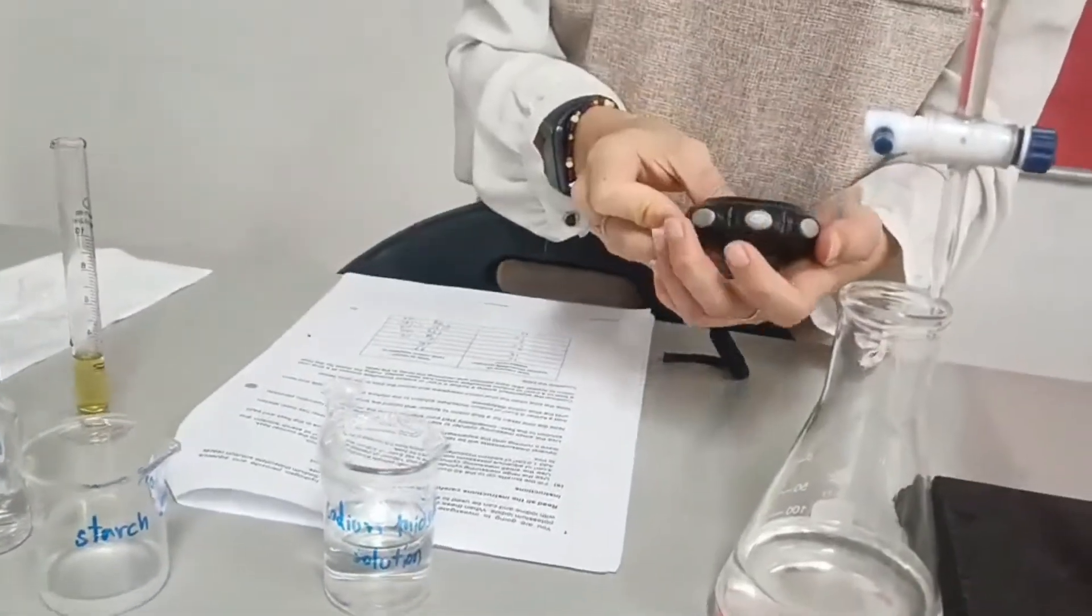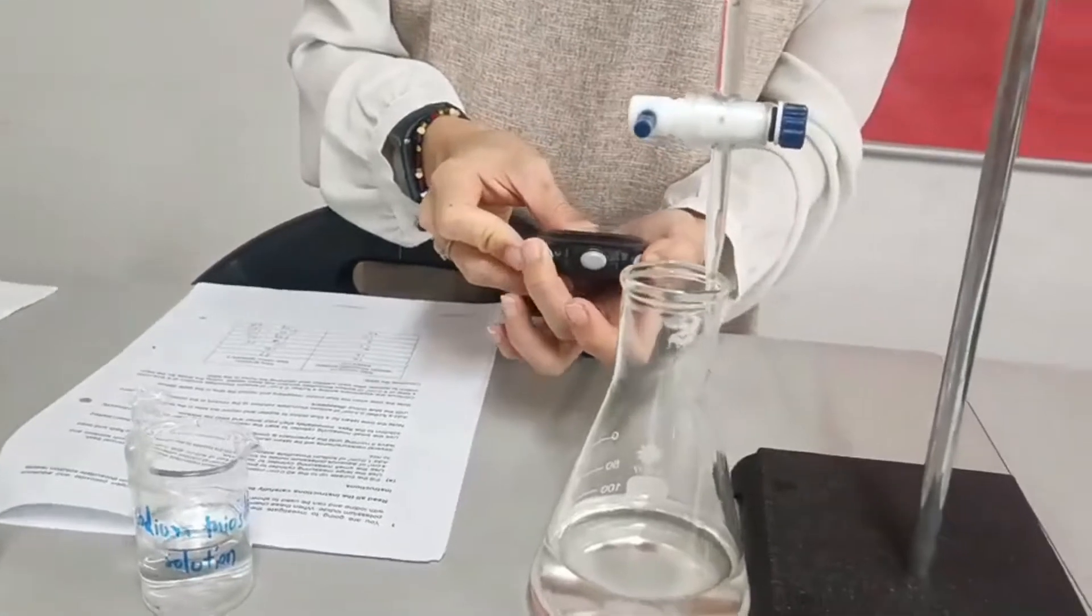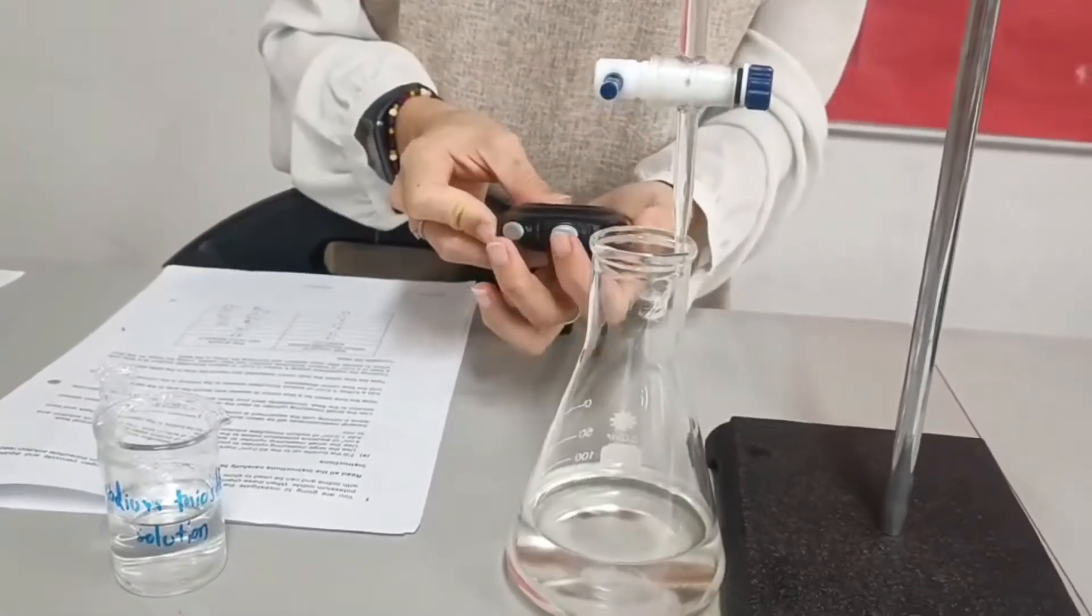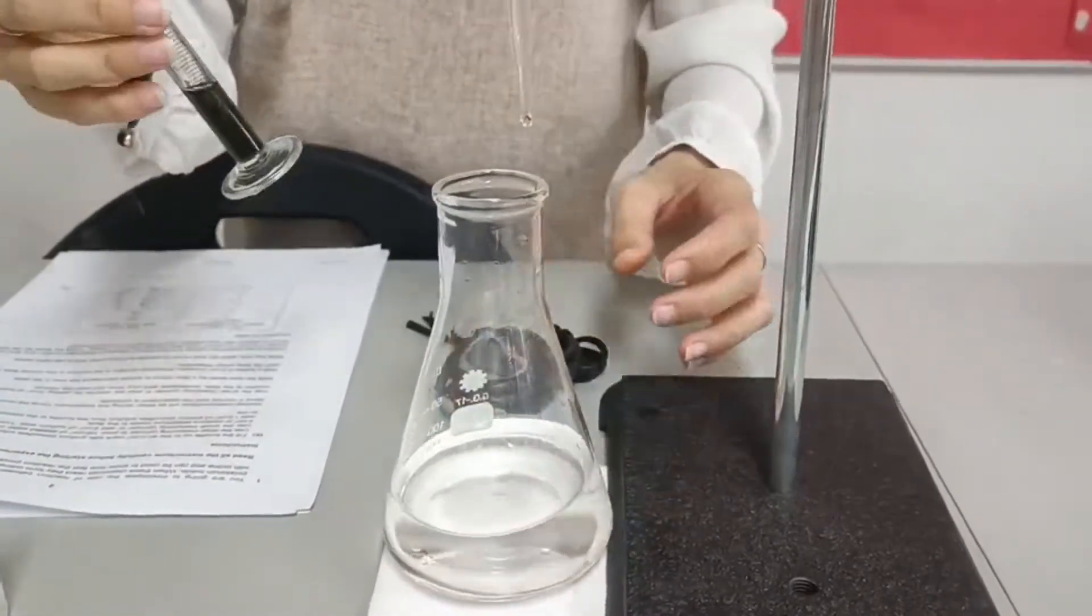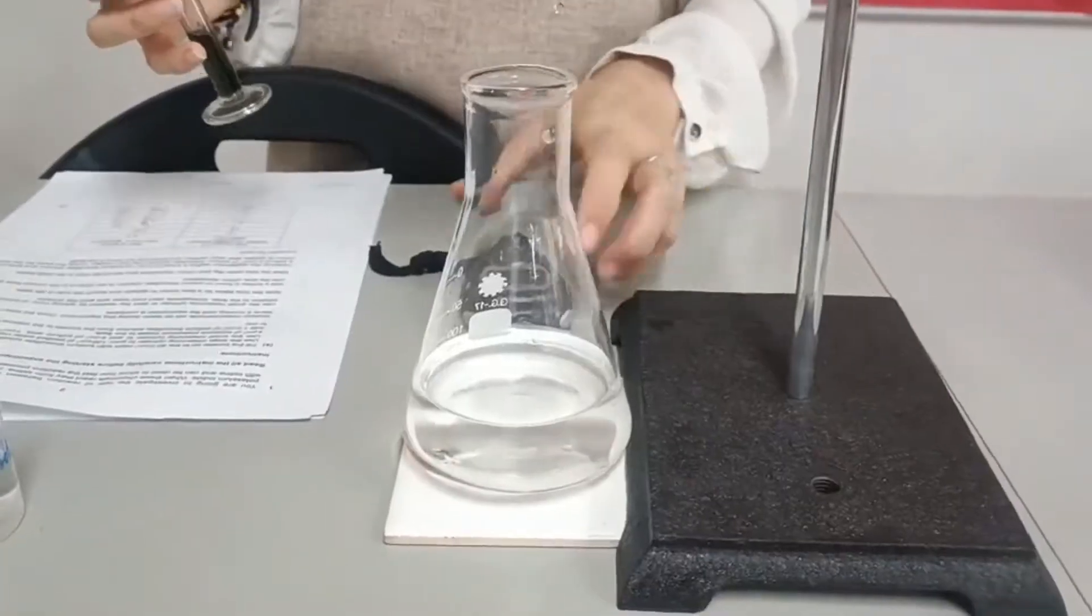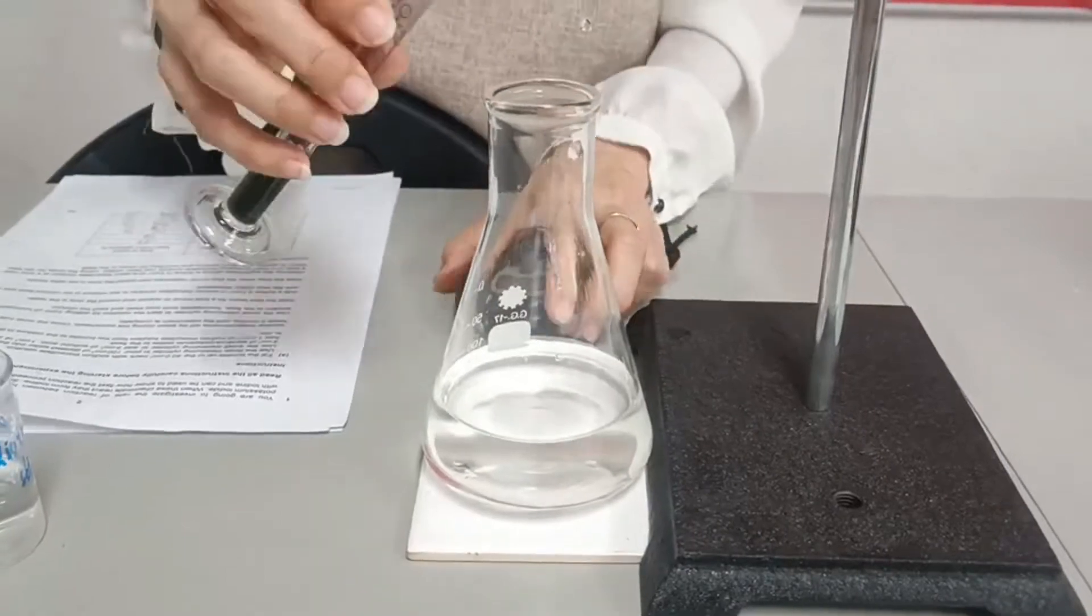And we want to start the timer the moment we add hydrogen peroxide in there. We start the addition of hydrogen peroxide and start the timer right away.